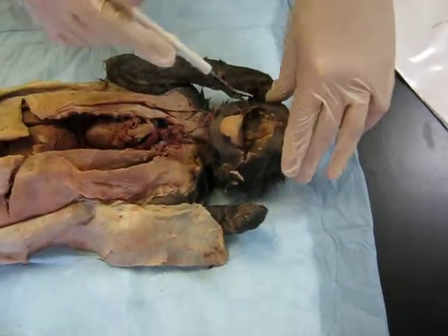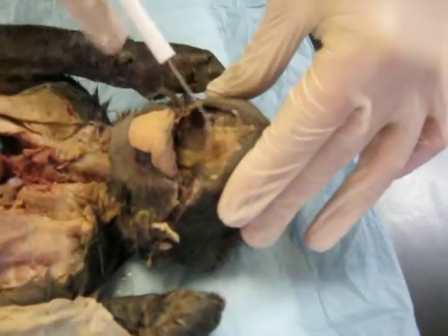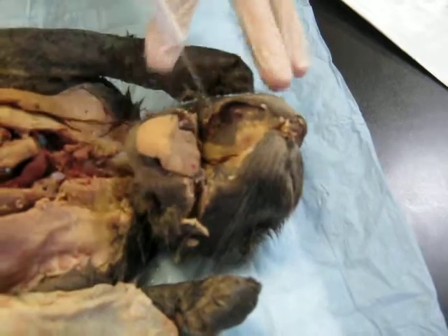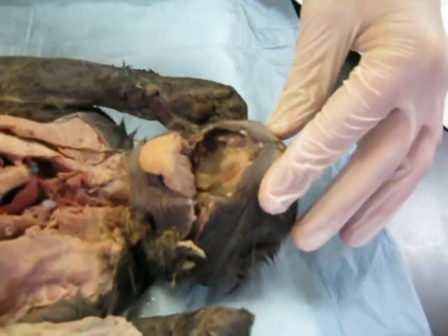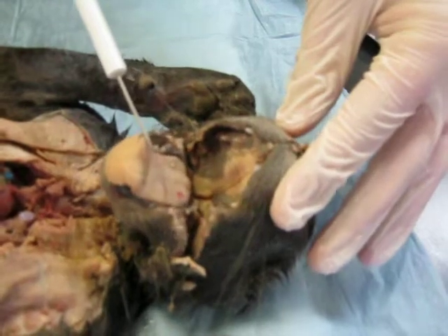Alright, so first I'm going to start with the salivatory system for my cat that I've dissected. The salivatory glands are located behind the upper incisors, directly underneath the tongue and at the back of the mouth. Basically, this supplies the mouth with saliva, which is helpful in digestion because saliva produces enzymes which help break down food, and it also just generally keeps the mouth wet.